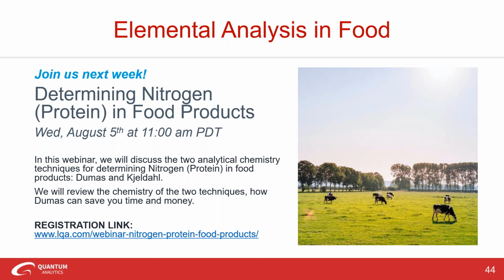All right, so we have a few questions that came in, so let's kick off that Q&A. All right, Brian, a lot of food ingredients have heavy metal limits for lead, mercury, cadmium, and arsenic at 0.1 ppm. Would XRF be able to reach that detection limit for heavy metals?